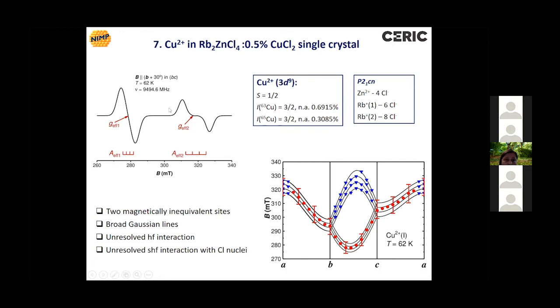Well, in the case of the second center here, you can say that the hyperfine line is partly resolved, and you can guess where each hyperfine line should lie. This is what is represented in this roadmap.